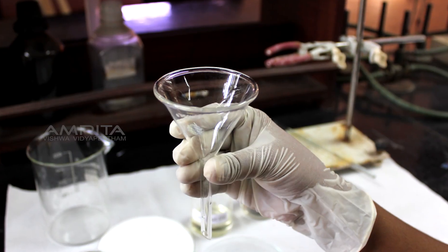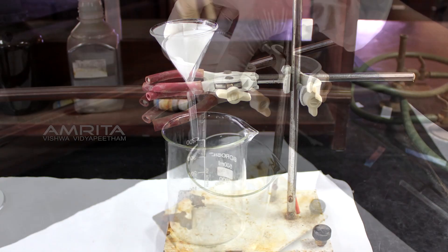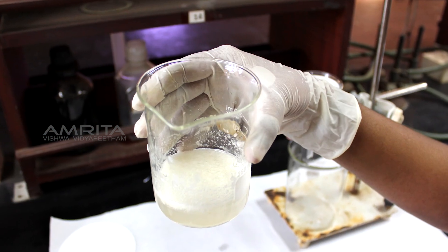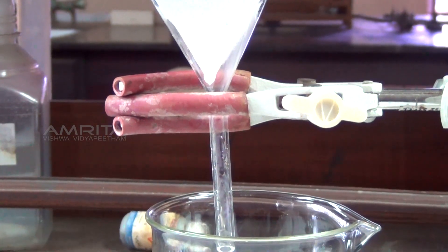Take a filter funnel and place the filter paper in it. Fix it in a stand and place a beaker below the funnel. Pour the contents of the beaker into the funnel over the glass rod and filter the contents.